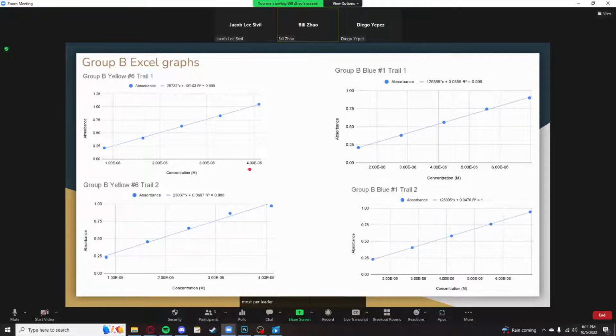And then we altered the concentration, reducing it in orders of 1/5. So the least concentrated was about 1/5 the regular concentration of pure dye. The second was about 2/5 the concentration, and so on and so forth. And doing this, we got 5 different concentrations.